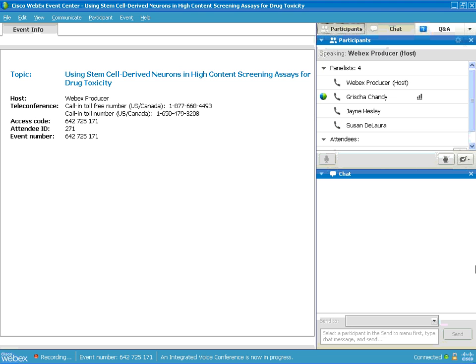However, we've also kept them in culture and they do stay viable. The longest that we kept them in culture, before finally getting rid of them, was around 9 months or so. We hadn't done all the functionality or characterization of the cells at that point. But definitely, if the compound is not too toxic to the cells, and depending on your assay, you could keep them in culture for 4 or 5 weeks or so, and the functionality should still be there.